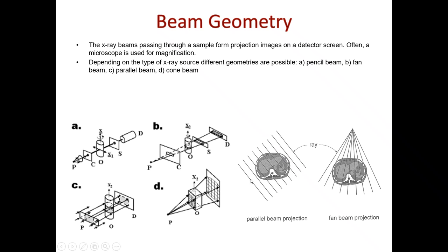And it's easier to pose these equations and calculate if this grid is parallel to the beams themselves and orthogonal to them. Whereas in this conical case, if I pose a regular grid, the beams are like a cone, they're denser here than they are here. Right? So that can cause slight changes in reconstruction, of course. So this is when the source is a point source. But of course, a point source is easier to execute in the lab. Okay?